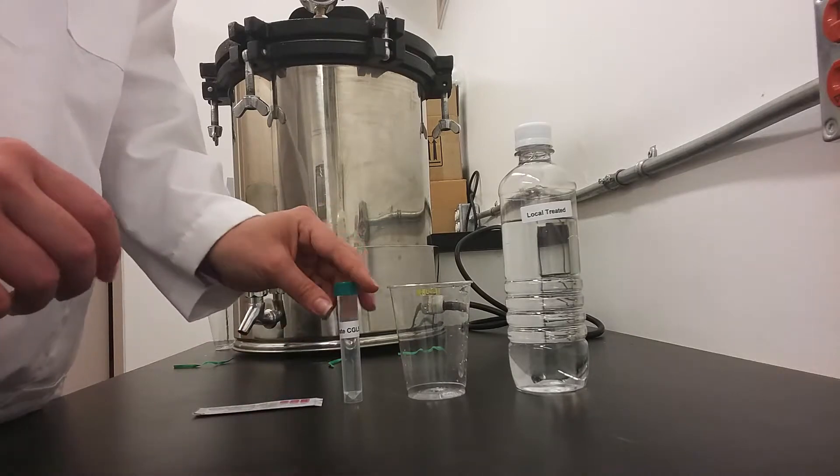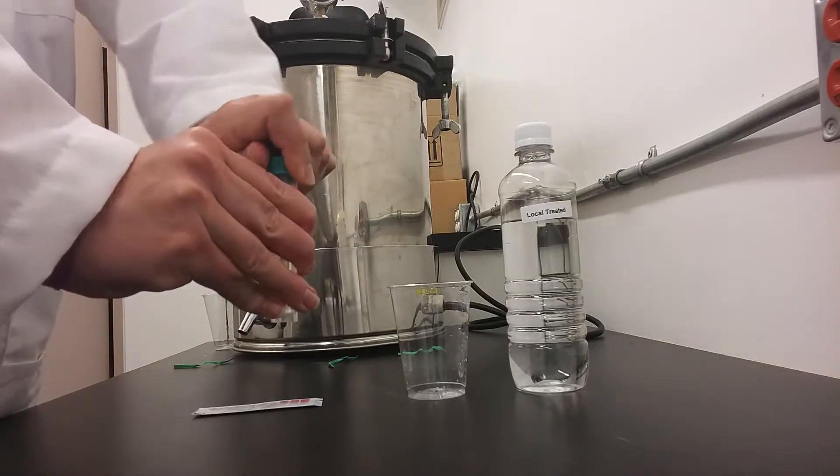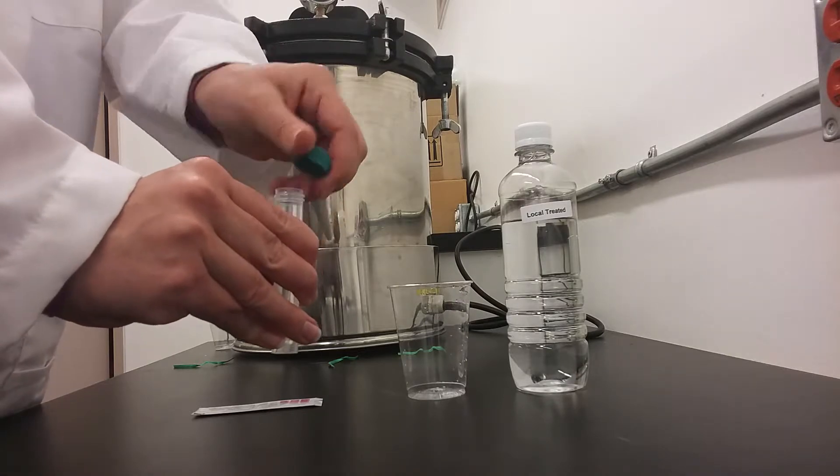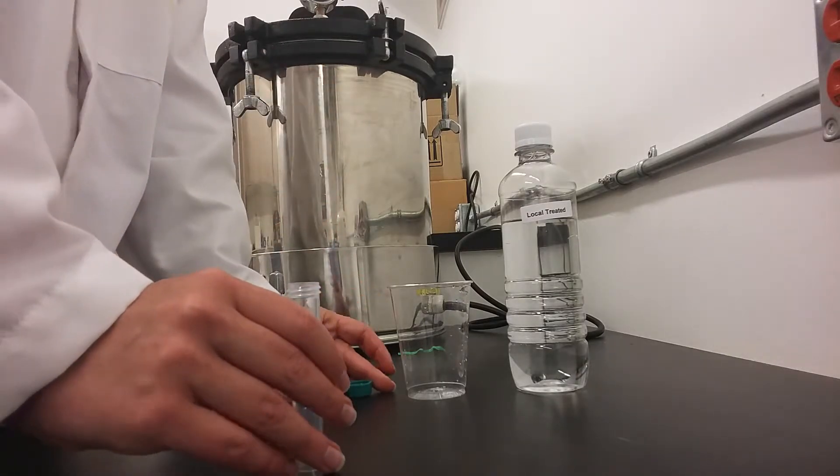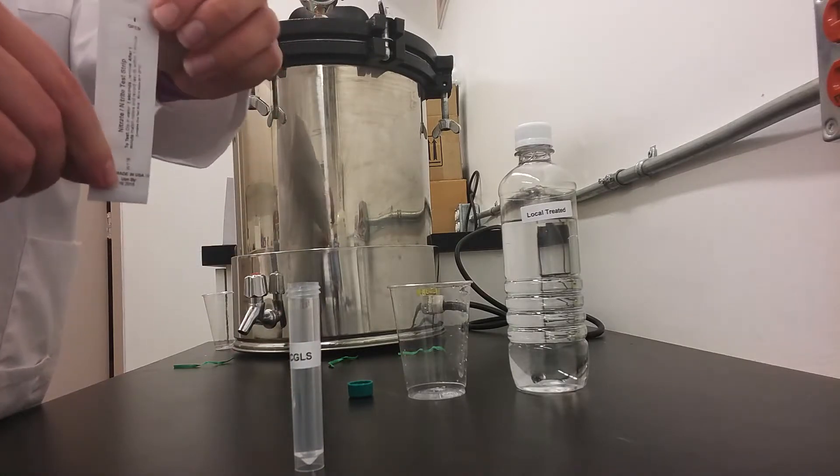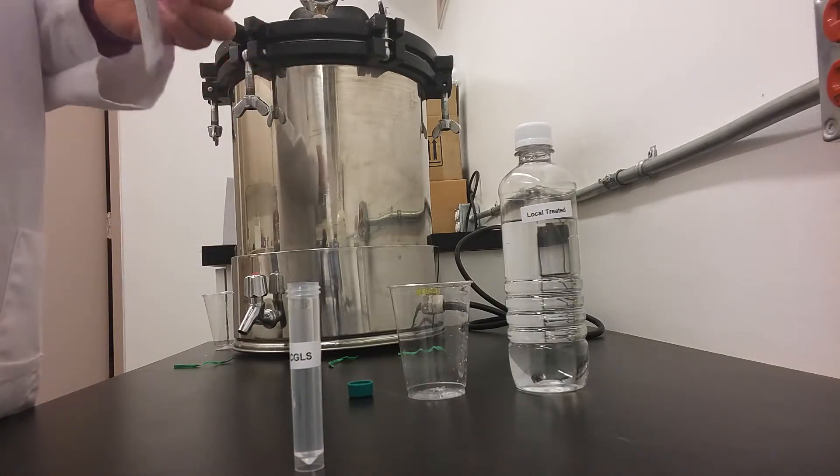For this test, you will simply open the Nitrate Canadian guideline sample water. Then you will open the test strip from the side that says 'open', being careful not to touch the indicator pad at the bottom of the strip.